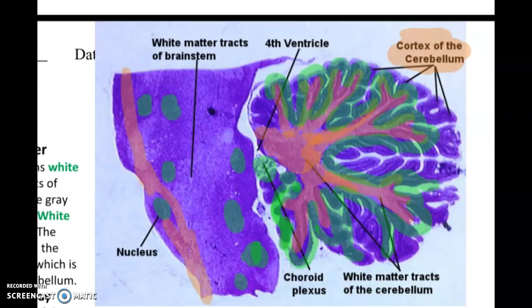And that's because white matter is myelinated axons. It is the main motor tract and sensory tract going to and from your brain. So you have a lot of white matter. It's basically a freeway, and then you have these little rest stops in there.